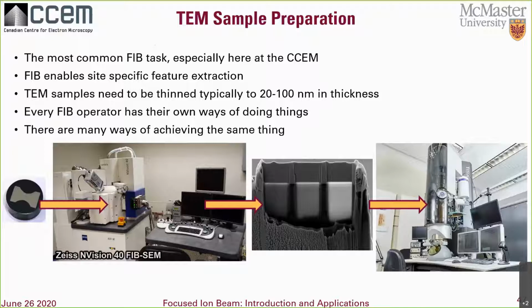Keep that in mind. There are many ways of achieving the same thing, but on the other hand, I've seen many images online of kind of bad looking samples, so maybe not all methods are equal. So here are the steps.